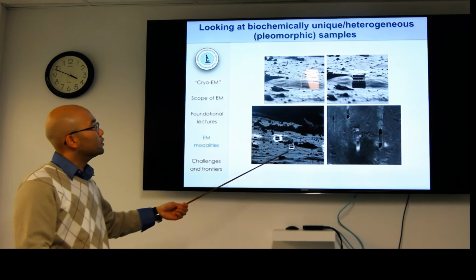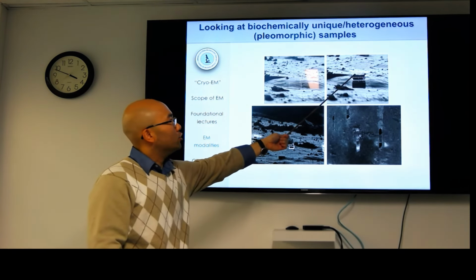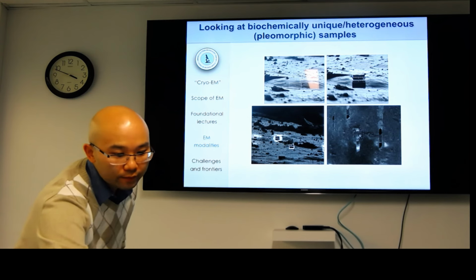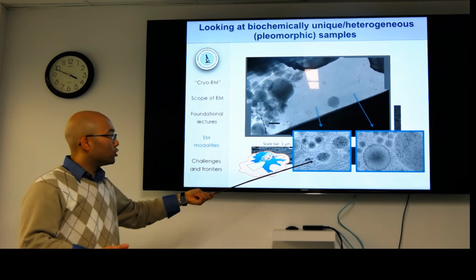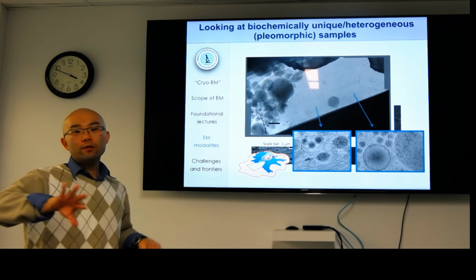Here's an example of what's done in the center. Here's a particular cell in the grid. With an ion beam, we can shave off a little bit of the top and the bottom of the cell. Here are different views of the windows into the cell that we've created. And we can collect a classical tomogram, and then from these images, we can either do normal reconstruction, or if you see repeating units, we can box them out and treat them with single particle techniques to really push resolution.